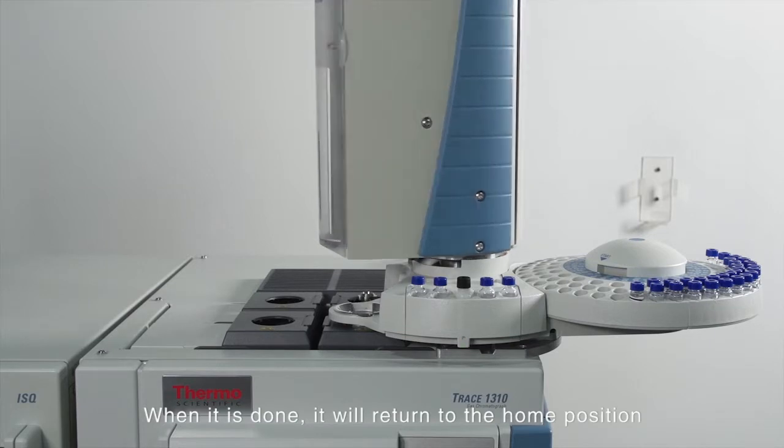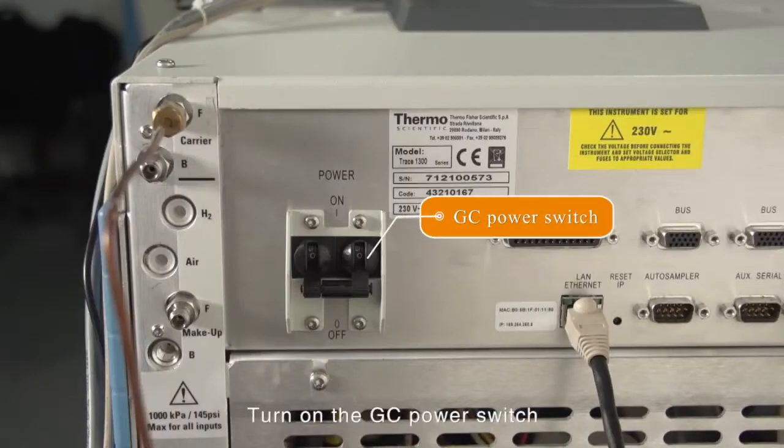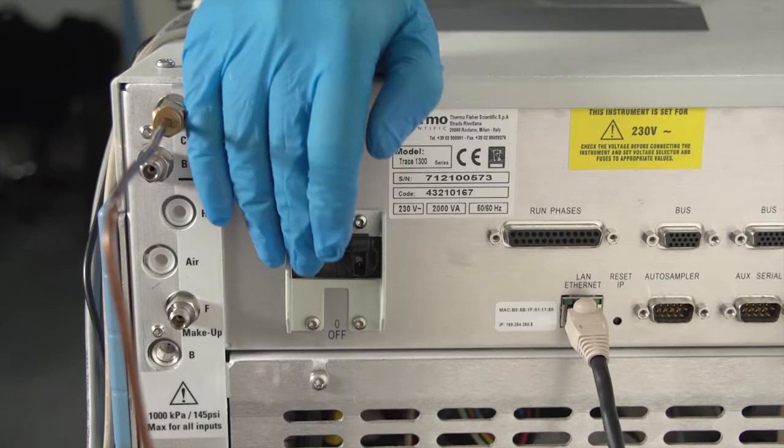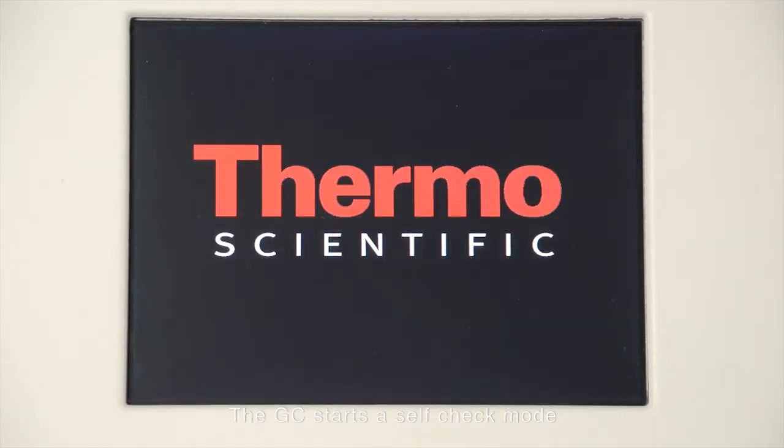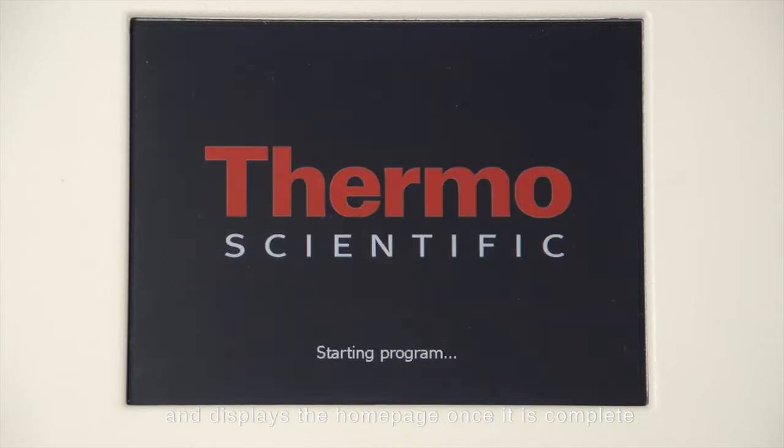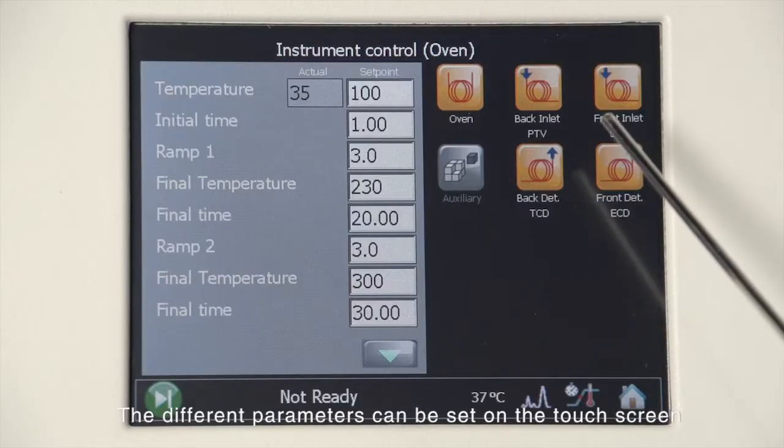Turn on the GC power switch. The GC starts a self-check mode and displays the home page. Once it is complete, different parameters can be set on the touchscreen.